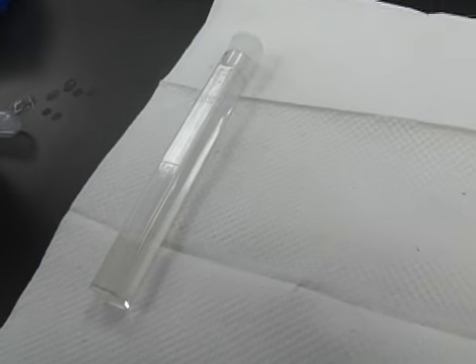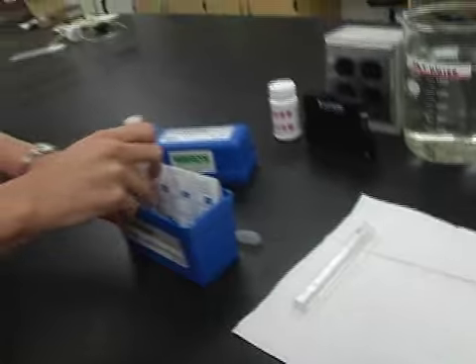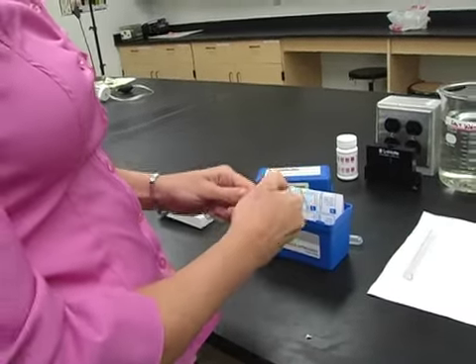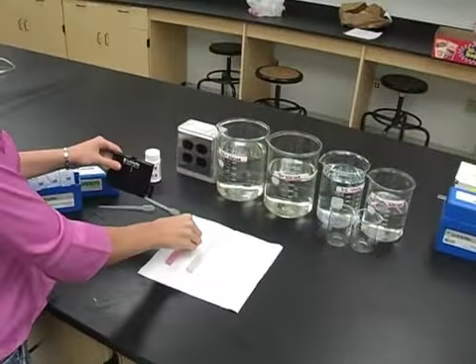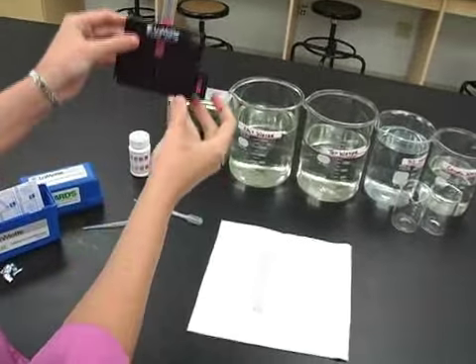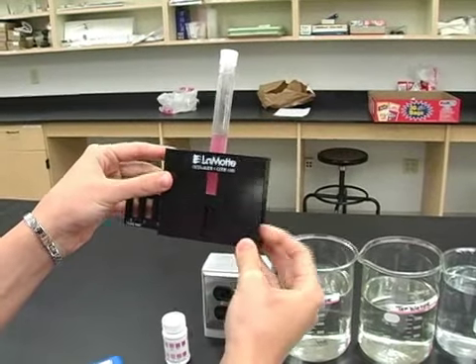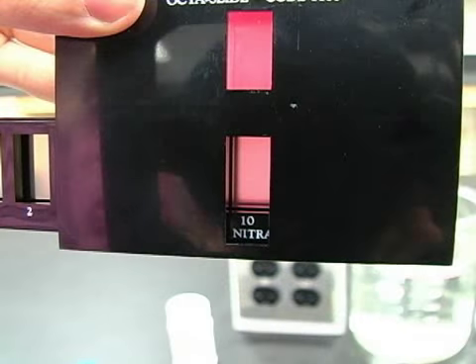While you are waiting, go ahead and repeat the steps for a sample of DI water. Remember, this is your control. Once 5 minutes has elapsed, place the test tube into the OctaSlide viewer. Match the color of the sample with the color standard. Record this number as the amount of nitrogen in ppm, or parts per million, in your sample. As you can see here, the value is approximately 10 ppm.